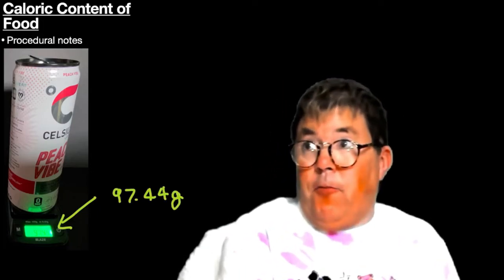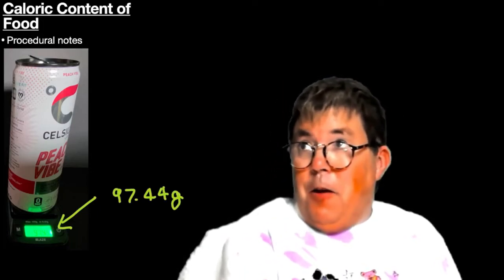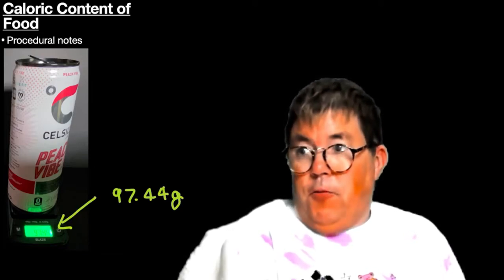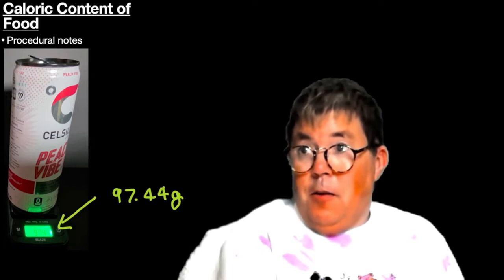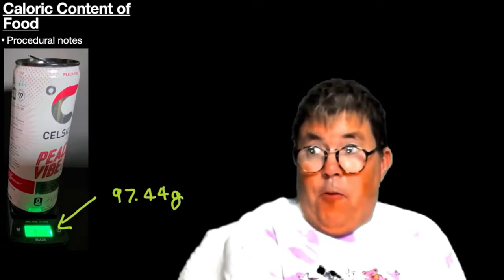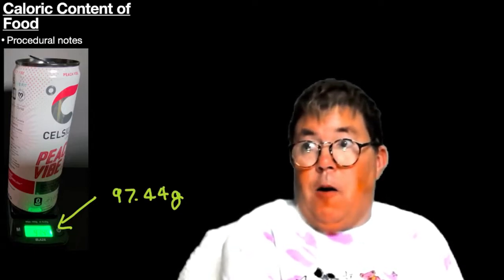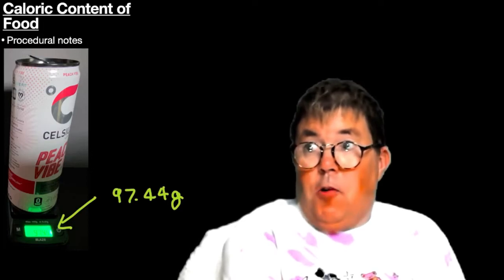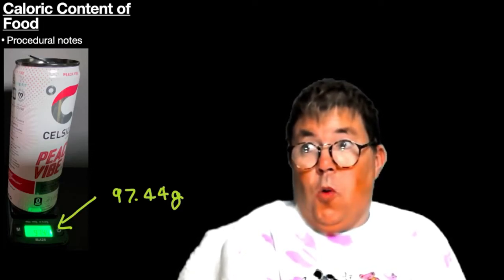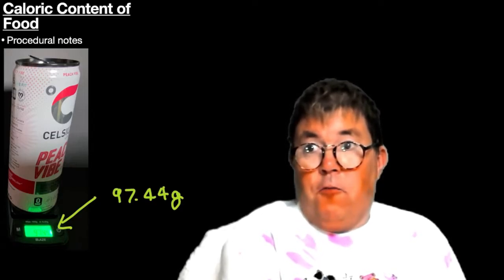Often what I find is many people report the weight of water as 50 grams. That is half the amount of water we are supposed to use. If we only have 50 grams of water, there is not going to be enough water inside the can to absorb the energy given off by the food.